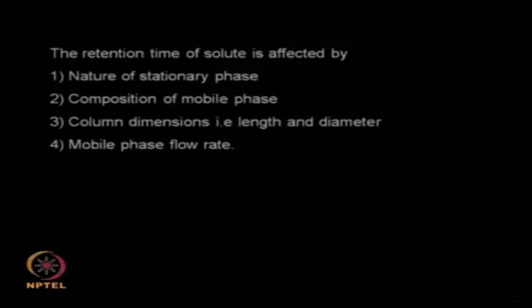So the retention time of a solute is affected by many parameters. The nature of the stationary phase, that means what type of stationary phase I am using, the porosity, particle size distribution, whether it is charged, uncharged, whether it has hydrophobic groups and so on. Composition of the mobile phase, which is a solvent: does it have water, pure solvent, or mixtures of solvent, what is the polarity of the solvent mixture, the dipole moment of the solvent mixture, the viscosity of the solvent mixture and so on.